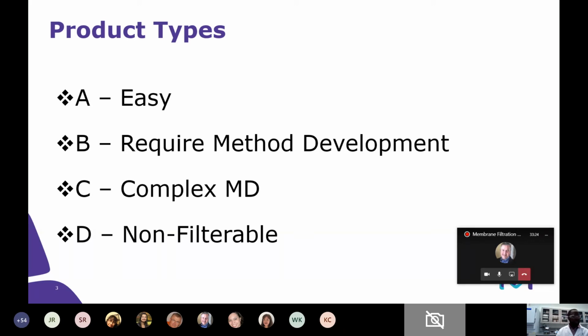Enzymes are possible. IPM, isopropyl myristate, and some other agents would help you either digest or dilute the product to be filtered. And there are other products, some suspensions especially, that no matter what you do you may not be able to filter. For these, you may not be left with any choice but direct inoculation.